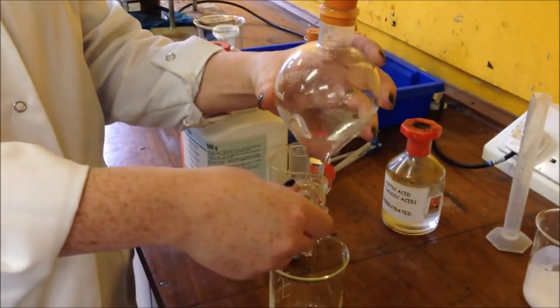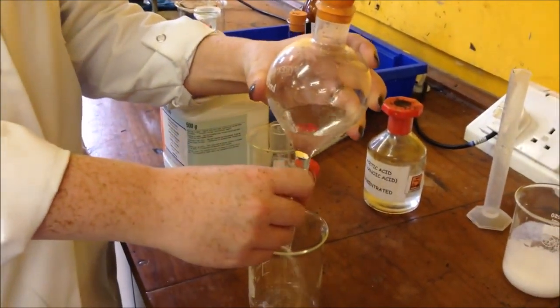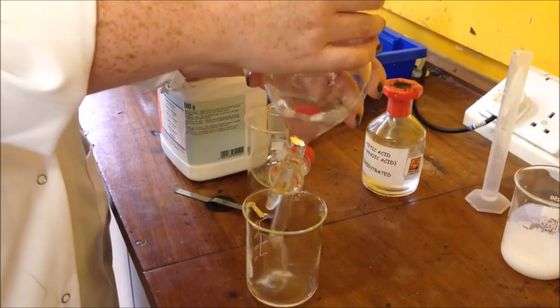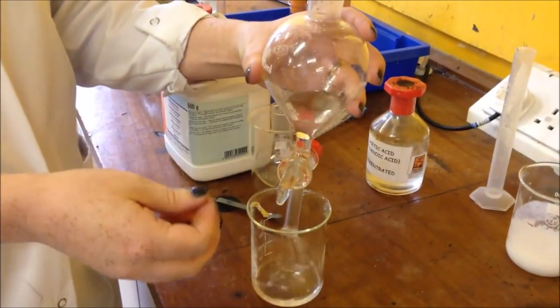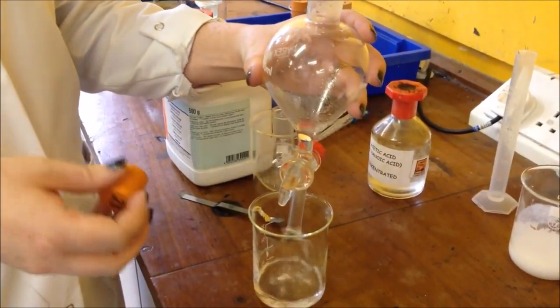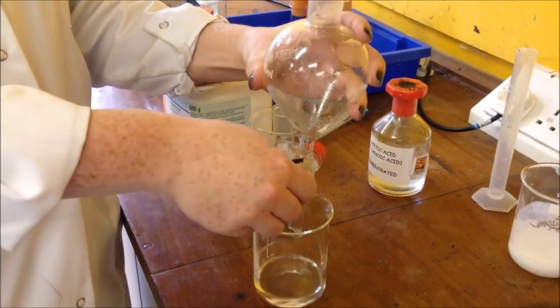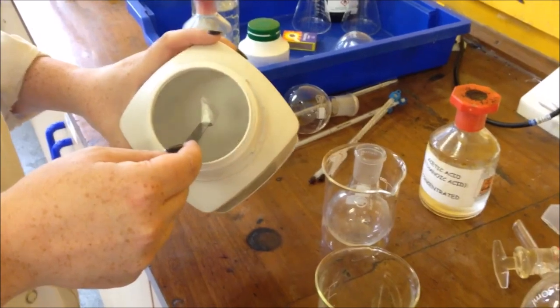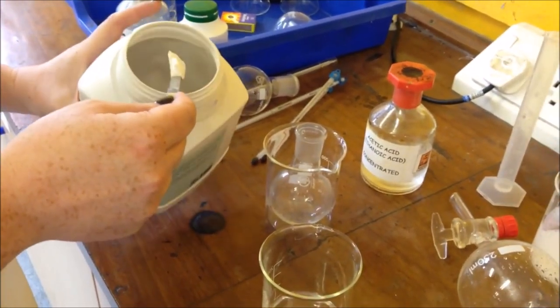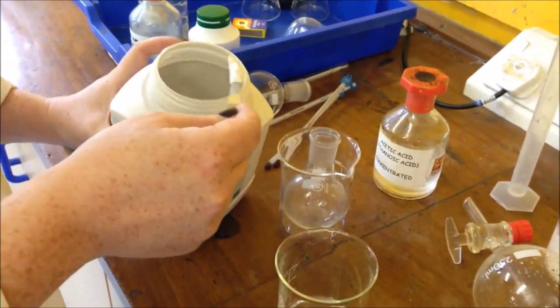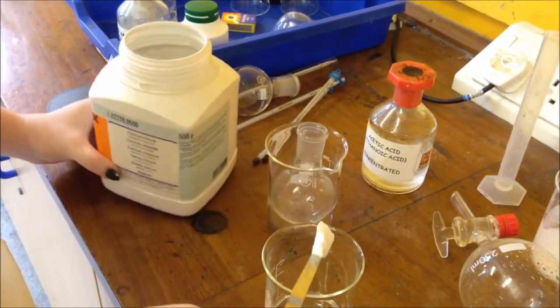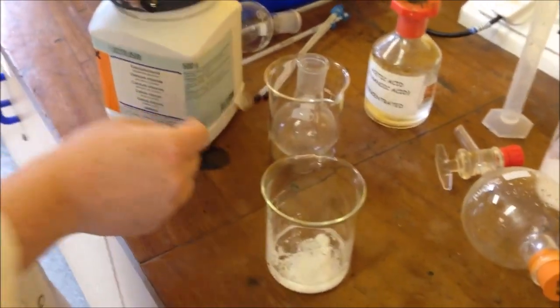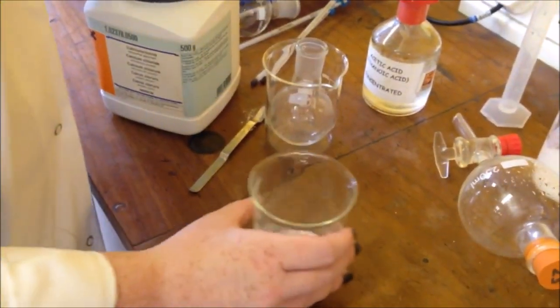So now that I've just got my top layer, I'm just going to add some solid anhydrous calcium chloride. Doesn't say how much so I'm going to add that much. Give it a bit of a swirl.